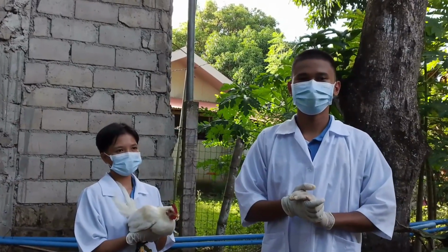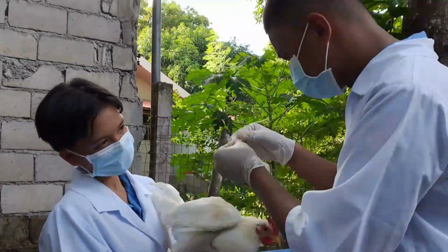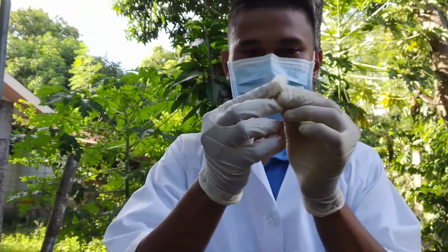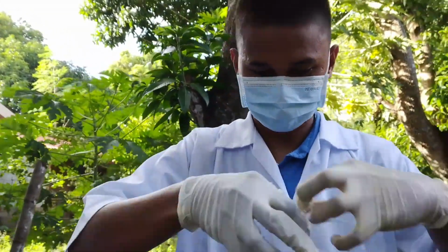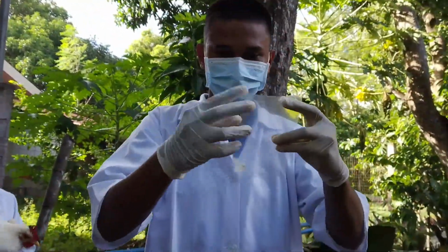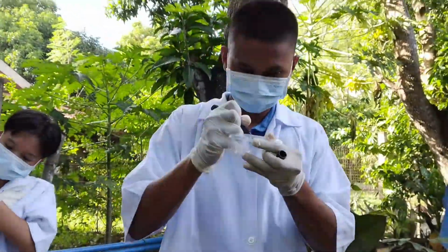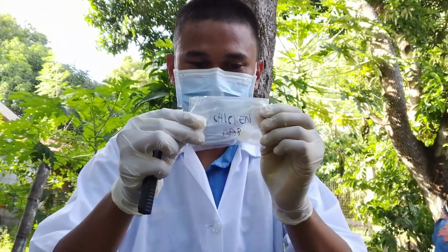I will now proceed to the third animal, which is the chicken. I have here the chicken hair, and I will now put it in the plastic. I am now done collecting the chicken hair.